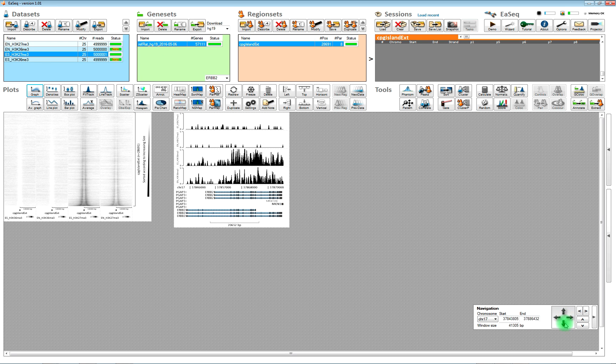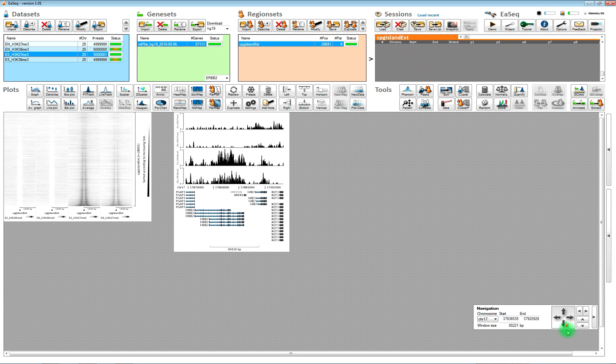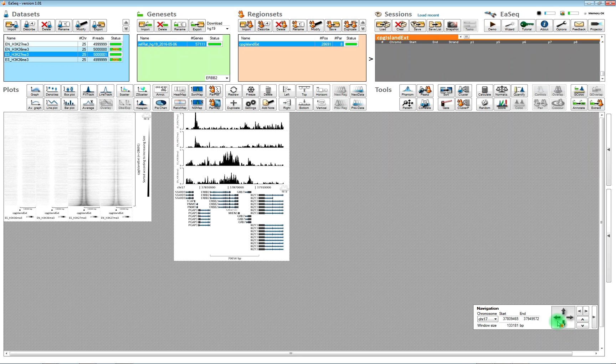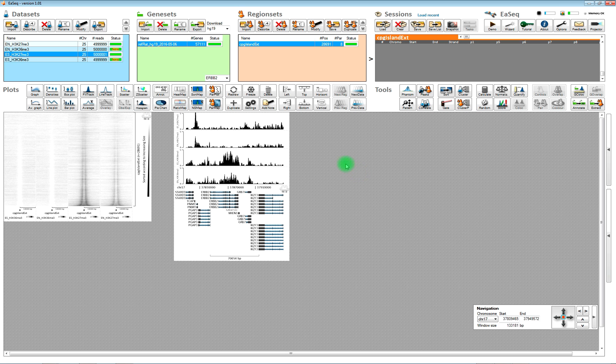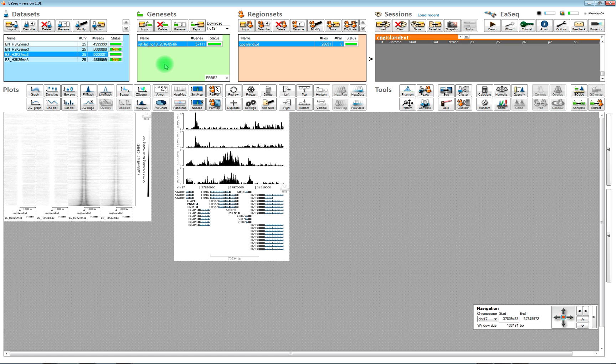And we can of course zoom in and zoom out using the navigation tool. And when we have a gene set imported, then we can use the gene set to extract regions into a region set.